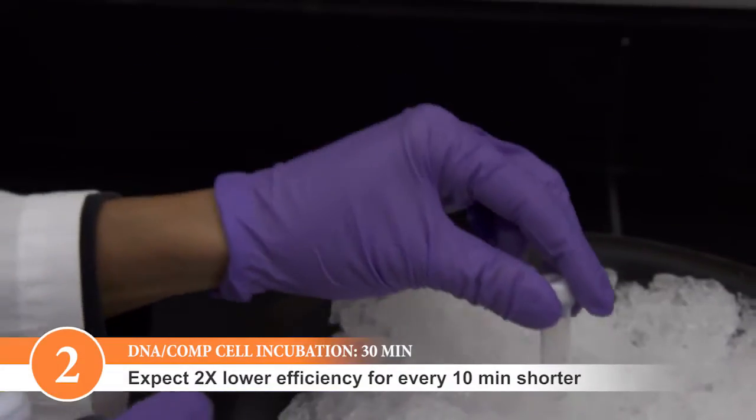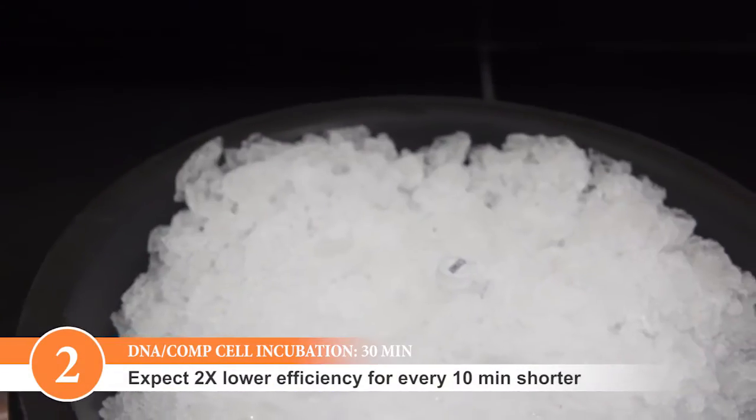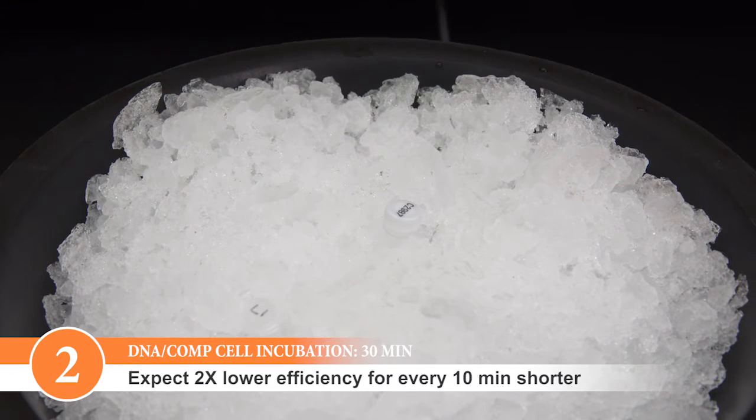For maximum efficiency, be sure to incubate on ice for 30 minutes. Expect a two-fold loss in transformation efficiency for every 10 minutes you shorten this step.